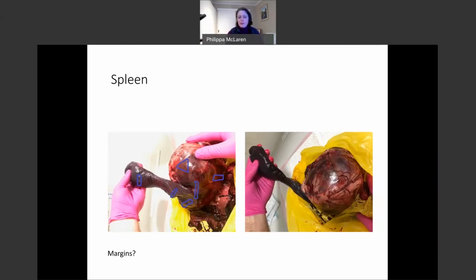And the suggestion was basically collect a range of these things. Stick the whole lot in formalin once you're done. Send us those little bits in 2 pots, the normal spleen bit and the mass bit, so we can tell them apart more easily, particularly at those 2 down at the base of the lesion where the spleen merges with that mass. But stick the whole thing into a tub of formalin to keep fixed. And if you can make a couple of good slices into it, that will help. You'll also, as I said earlier, need to change the formalin in that pot because the blood deactivates it.